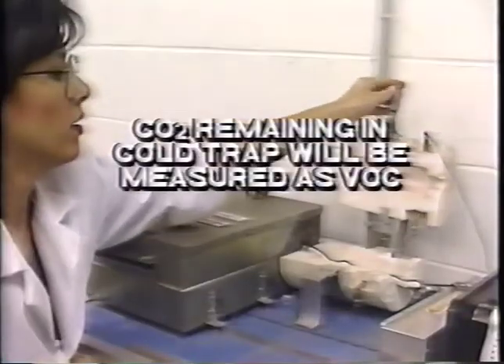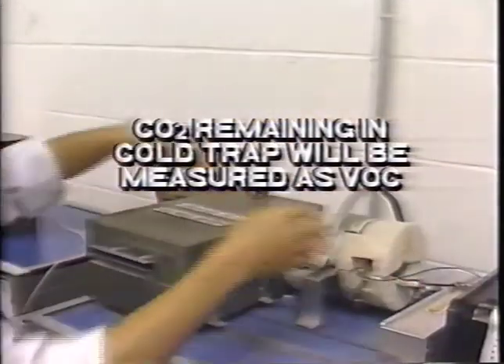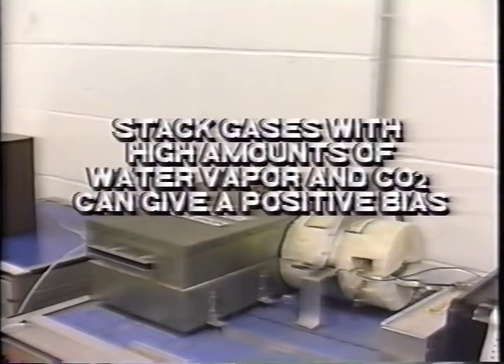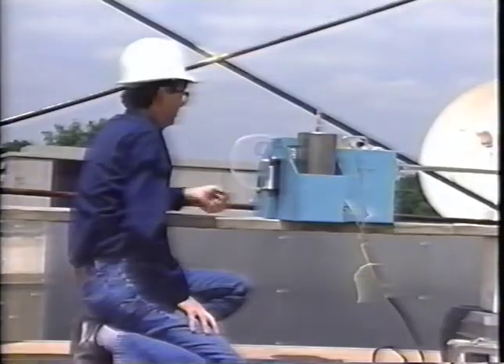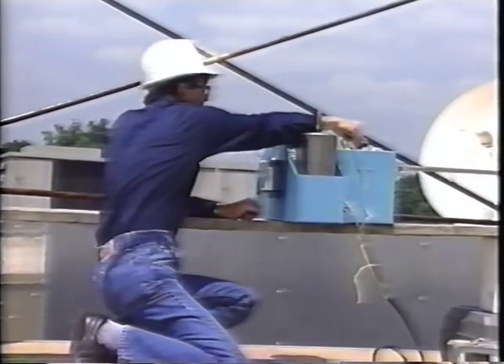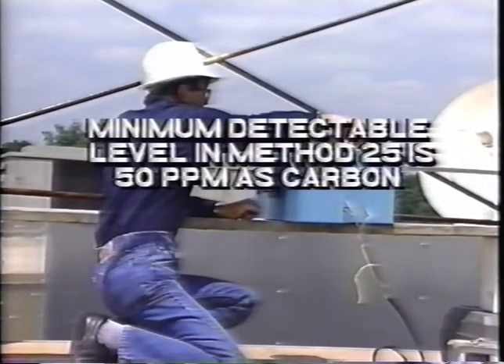Note that any CO2 trapped in the frozen water in the cold trap during sampling and not purged into the first sample tank will be measured as VOC. Therefore, stacked gases with high amounts of water vapor and CO2 can give a positive bias. In addition, analysis of blank sample runs have produced results that are relatively high and variable. This accounts for the high minimum detectable, which is 50 ppm as carbon.